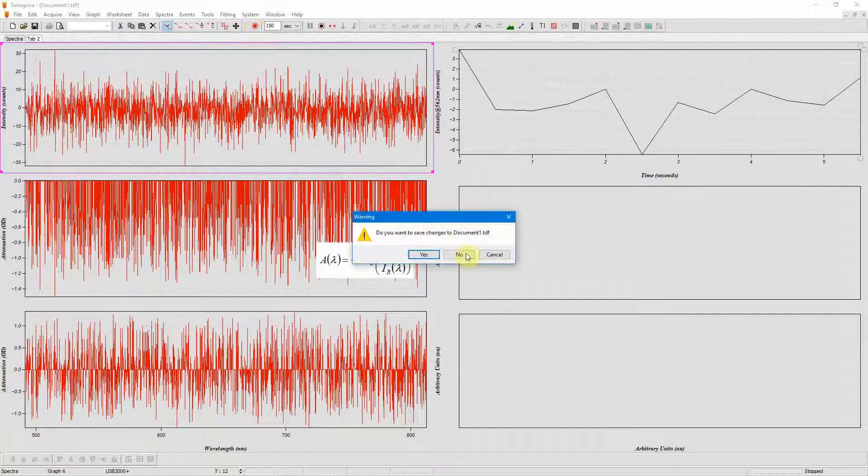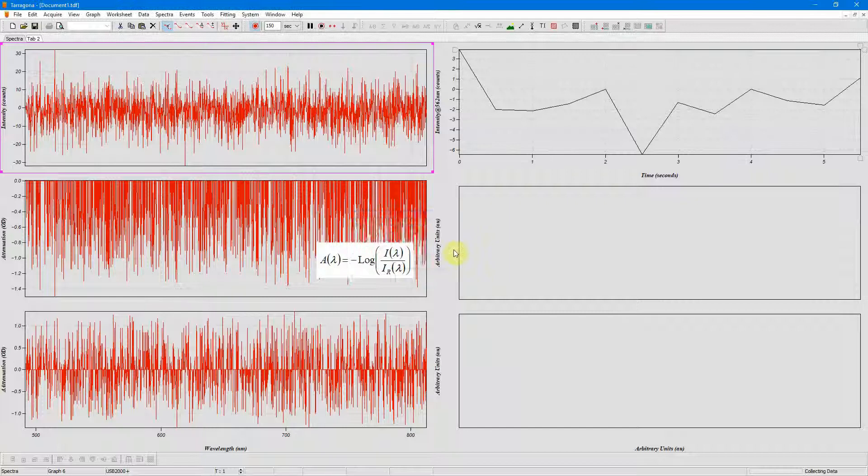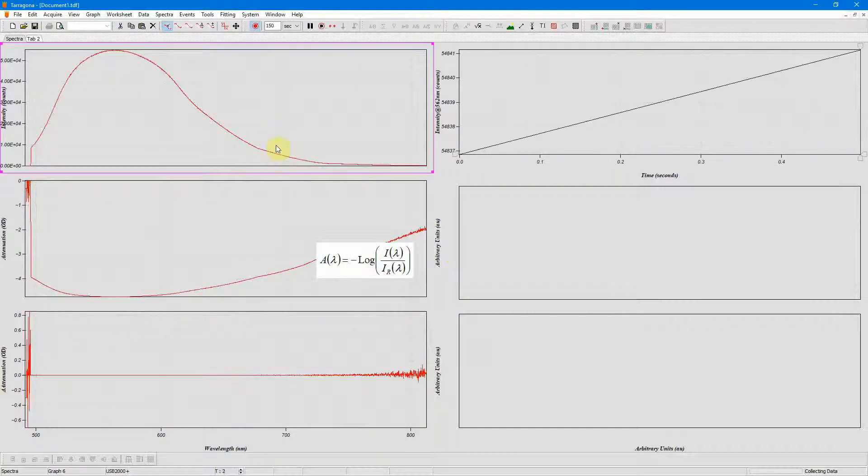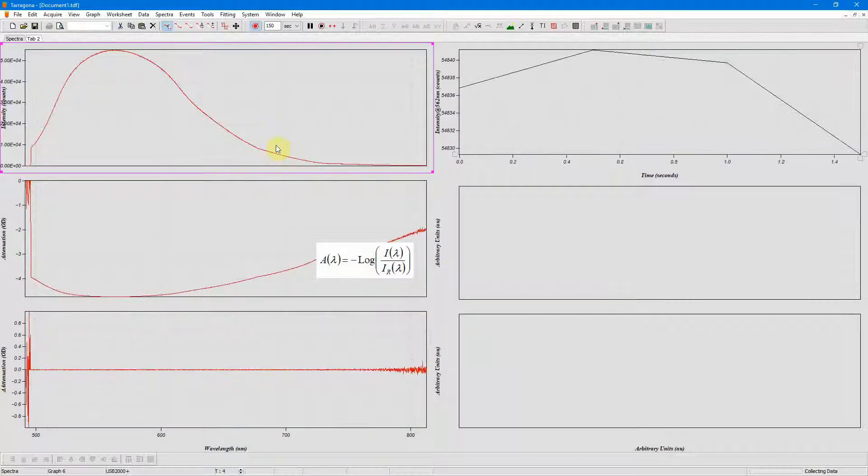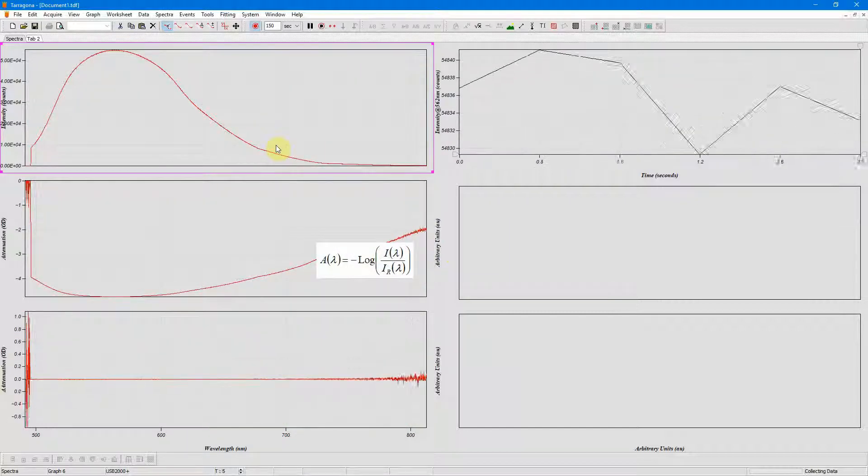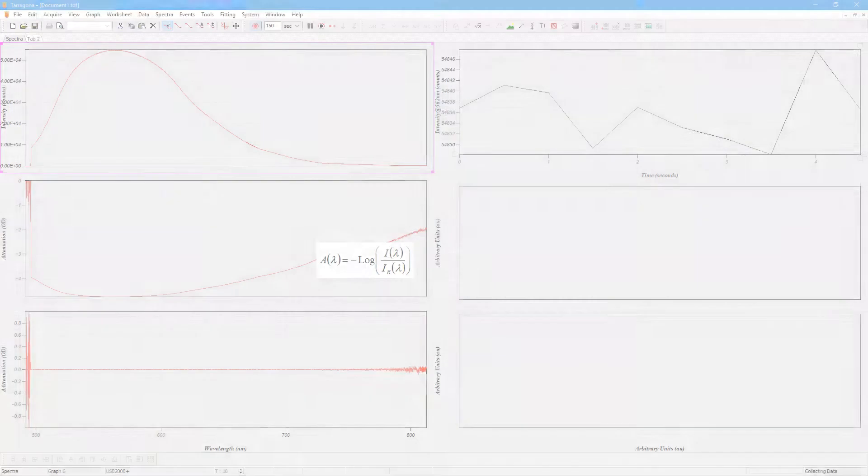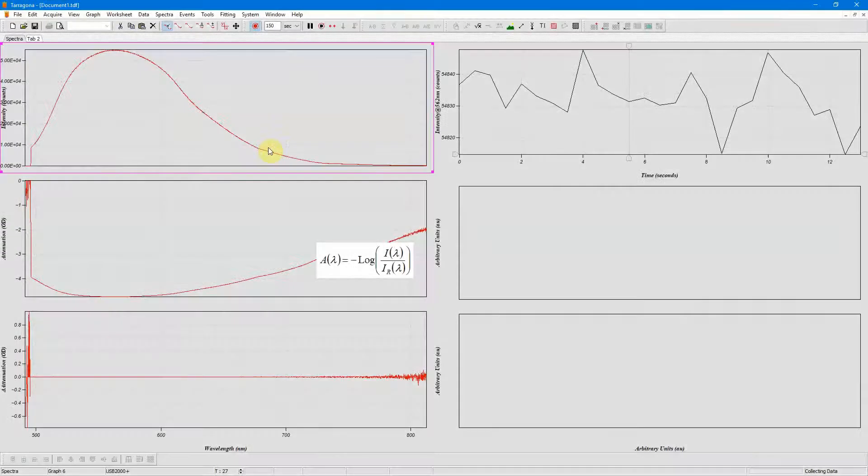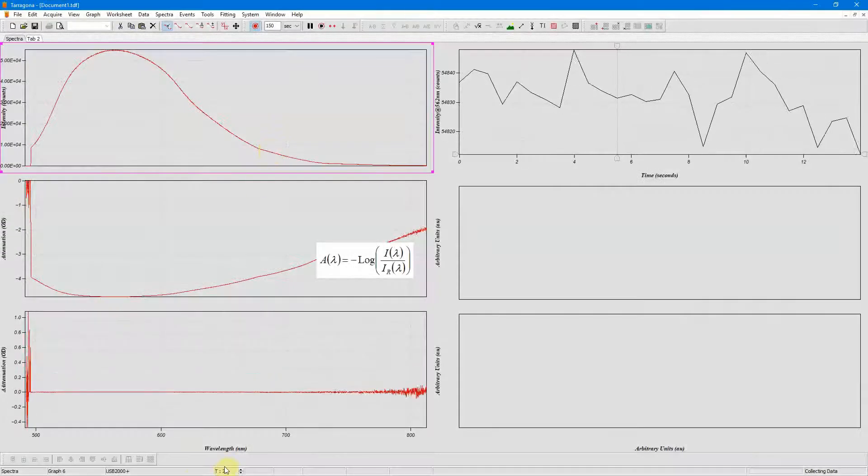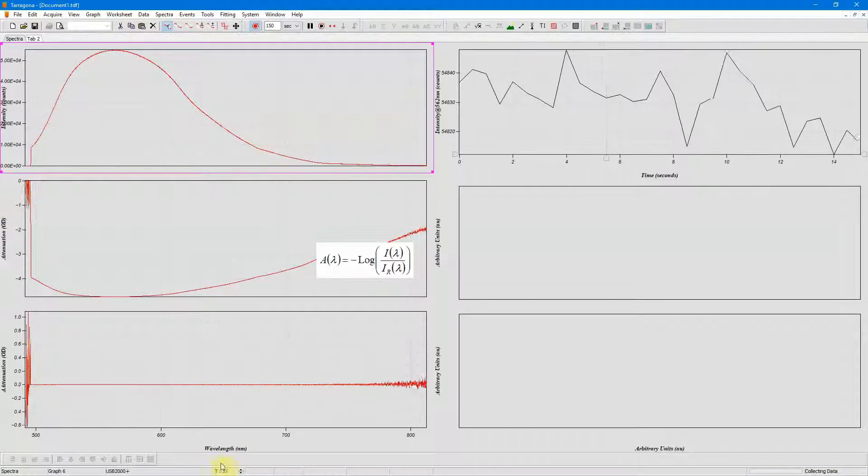I'll start collecting and these are my spectra. I need to collect about 30 so I need to wait a moment. Now I've collected about 30.